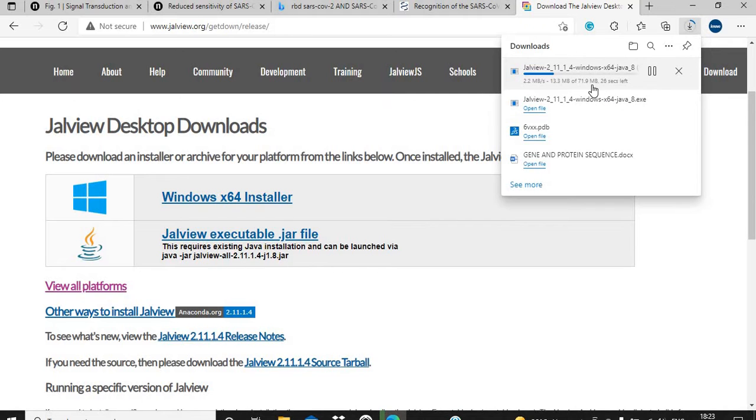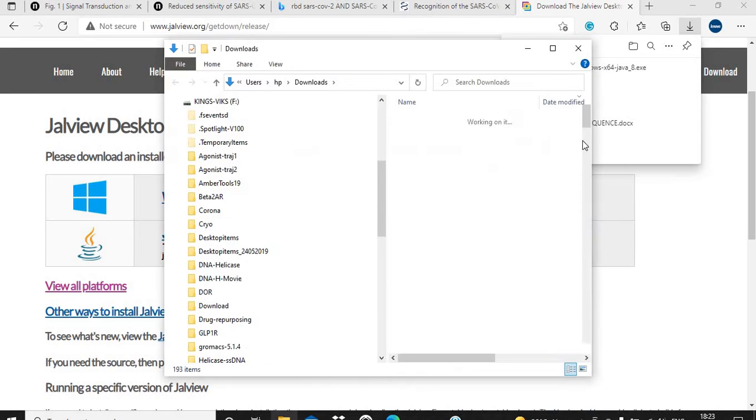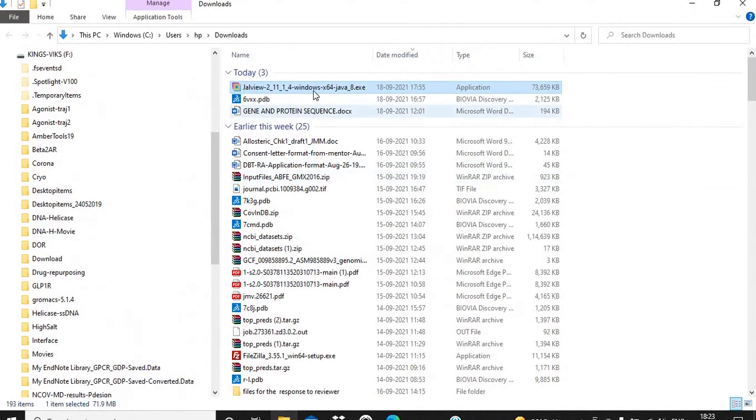In order to download, I have already downloaded this software, so I'm going to cancel it. The executable file is here.